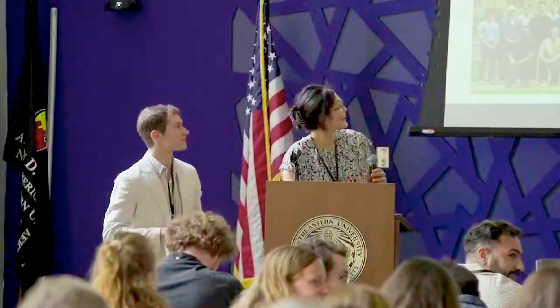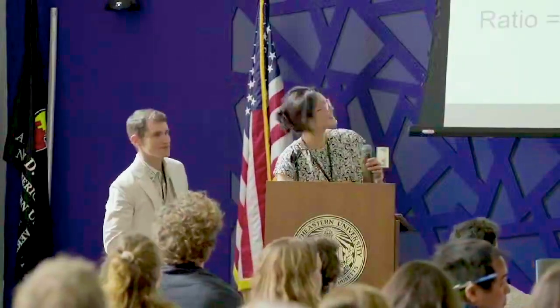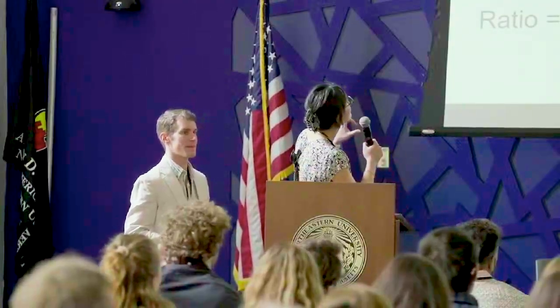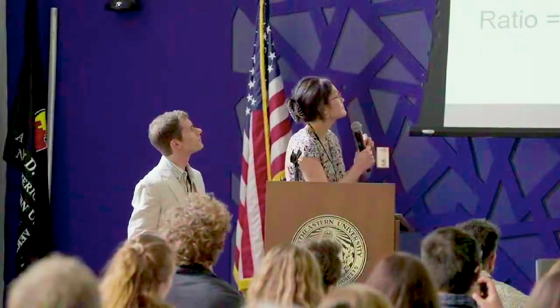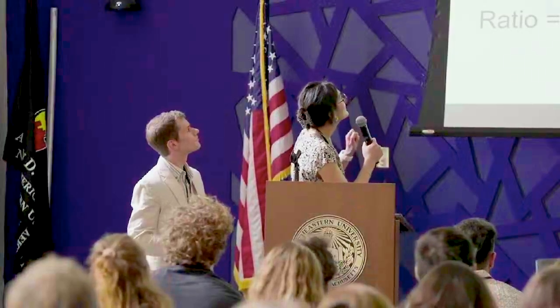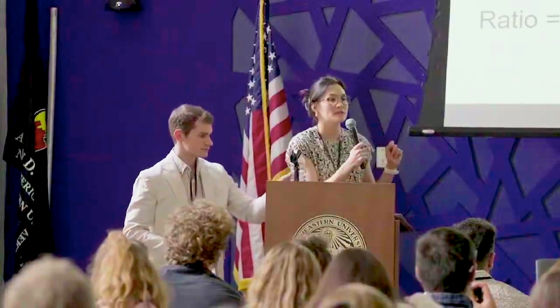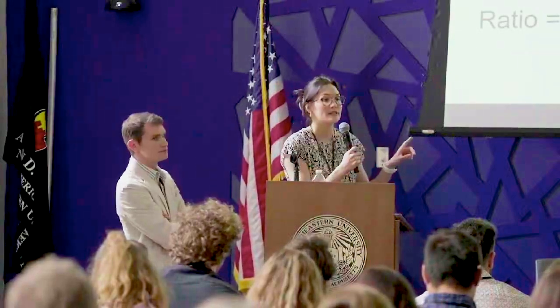Thank you. Just going back to that intersecting peptide Venn diagram, I'm one of the non-technical people that Nikolai is encouraging to ask questions. What's on the non-label-free side? Is that just tag that hasn't attached, or what's the 8677 number? On the Venn diagram. Oh yeah, this is the number of unique peptide sequences that were found to be labeled with PSMtag, but were not found to be present in the label-free peptide population.